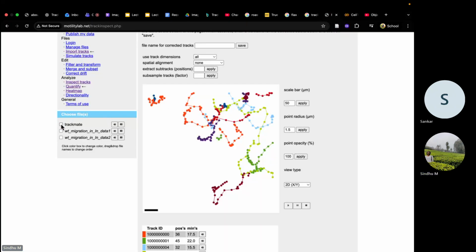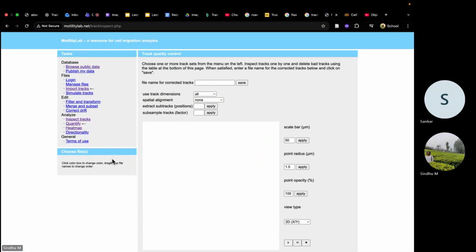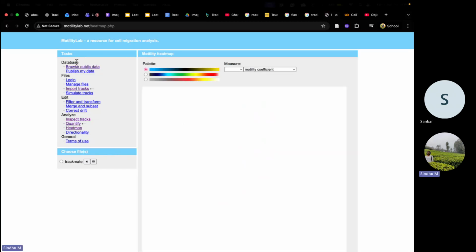Still not. Yeah, this has still not worked.